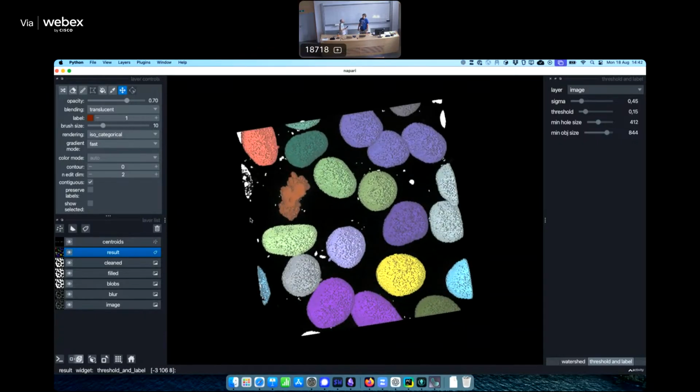And maybe before we go to the plugin generation, why do we decide on this? What could a widget be? It could be a functional widget, it could be Magic GUI, where you call the proper function from Magic GUI directly to generate a widget, or it could be a Qt widget, generated by writing Qt code. From our experience, the Qt code is harder, but if you try to do something more complex, please do not be stuck to the functional widget, because we see some monsters in the code.